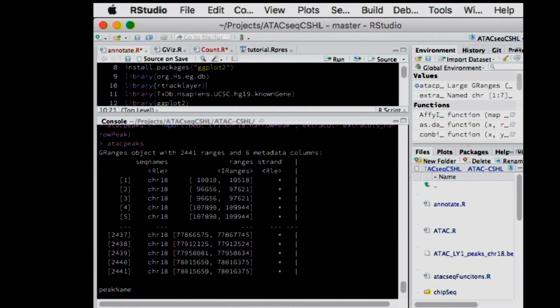Yeah, it sort of depends, because it's paired-end sequencing and based on that fragment length distribution, the entire regions end up being about 500 base pairs. That's like the median, but they can be longer. Does it call them narrow?